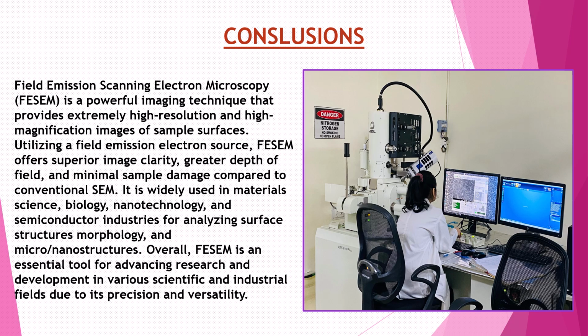Overall, FESEM is an essential tool for advancing research and development in various scientific and industrial fields due to its precision and versatility.